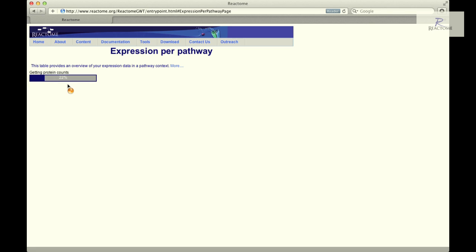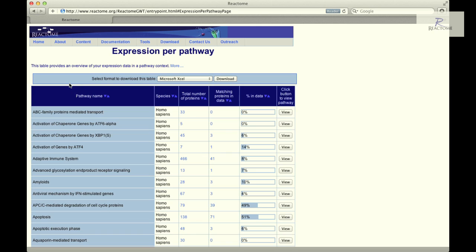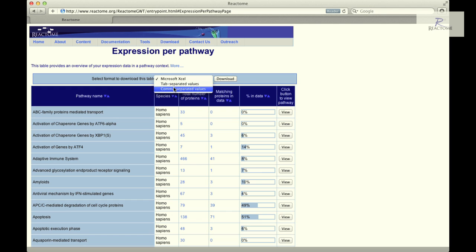After a few seconds, a table of results entitled Expression Per Pathway will appear. The Expression Per Pathway results are presented as a sortable table that can be downloaded as a Microsoft Excel spreadsheet or a tab or comma separated values format.